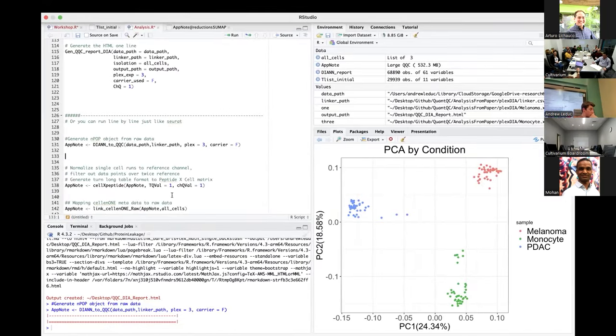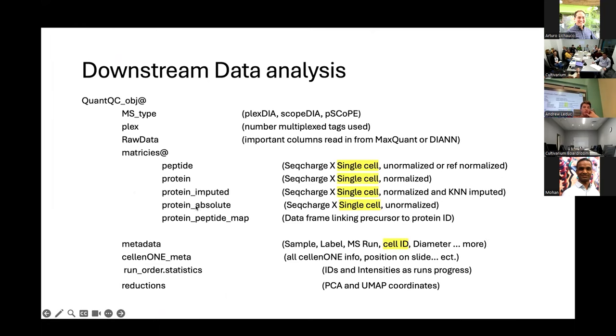Just one question. What's the protein abundance? Absolute. This is protein abundances, but not normalized. So there's still some interesting information you want to know, like what the most abundant protein is. It's the abundance without any normalization, I suppose. So it's just, I think, MaxLFQ-style intensities of each protein. If you have a bigger cell, all the proteins will be larger, and actin will be your highest protein, and some transcription factor will be lower.